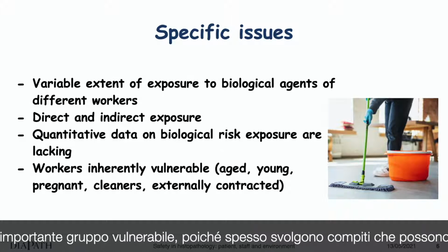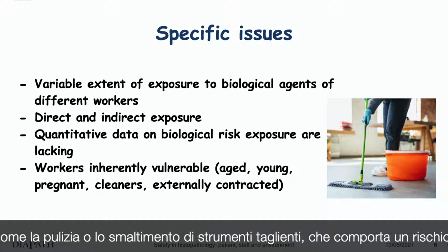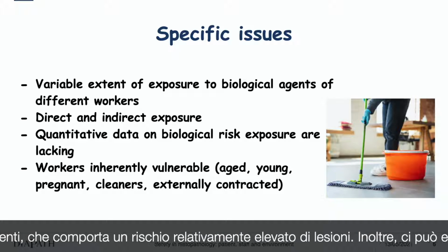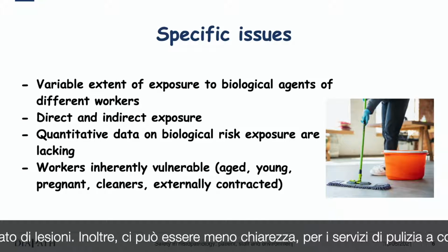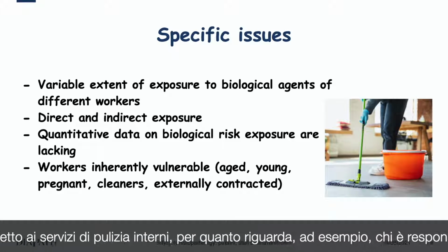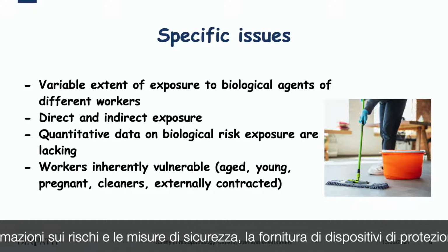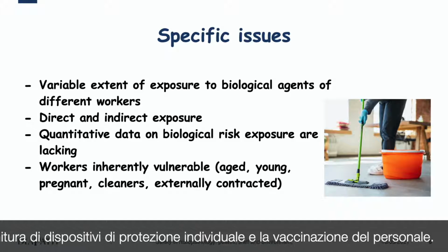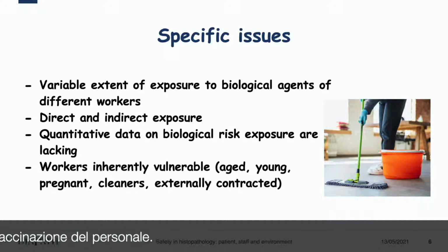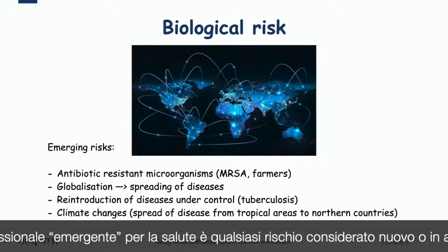Experts consider cleaners to be an important vulnerable group since they often perform tasks that may put them at risk, such as cleaning or disposing of sharp instruments, which poses a relatively high risk of injury. In addition, there may be less clarity for externally contracted cleaning services compared with internal cleaning services with regard to, for instance, who is responsible for providing information about risks and safety measures, the provision of personal protective equipment, and the vaccination of personnel.